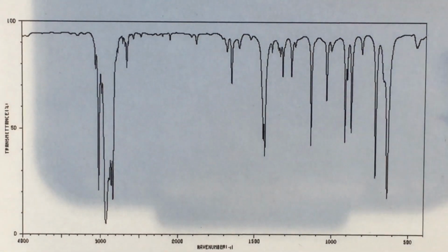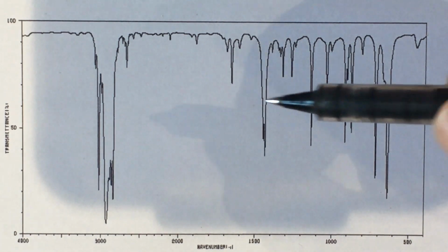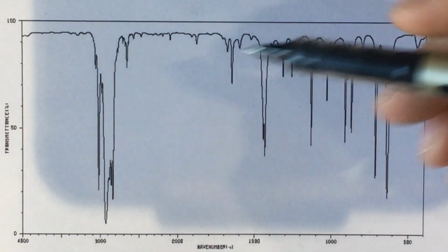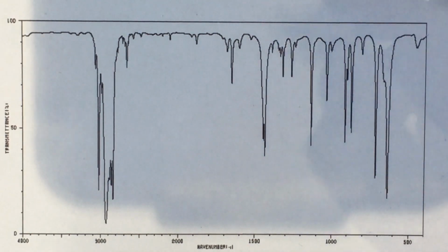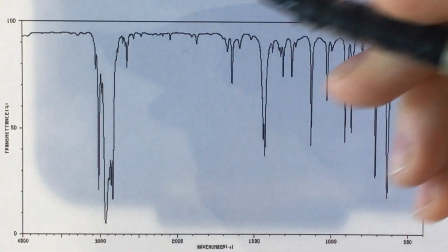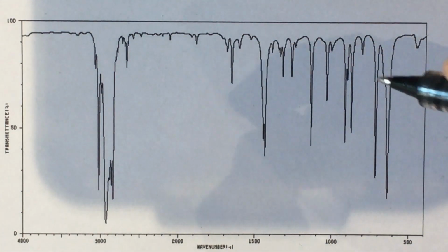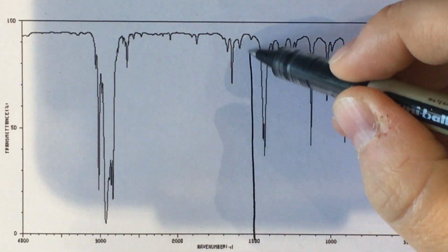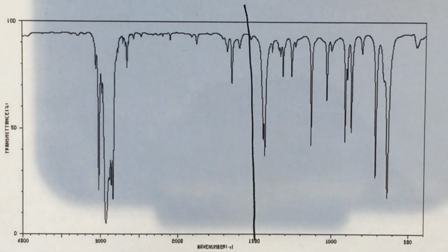Right, so this is an infrared spectrum. You can see the x-axis is wave number. That's like a frequency of radiation. Transmittance is on the y-axis, so that means that all these things that are going downwards are called peaks, even though we might expect a peak to normally go up. We call them peaks.